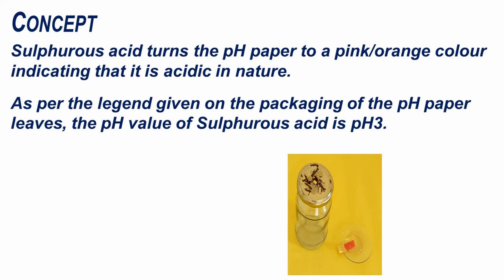Sulfurous acid turns the pH paper to a pink orange color indicating that it is acidic in nature. As per the legend given on the packaging of the pH paper leaves, the pH value of sulfurous acid is pH 3.